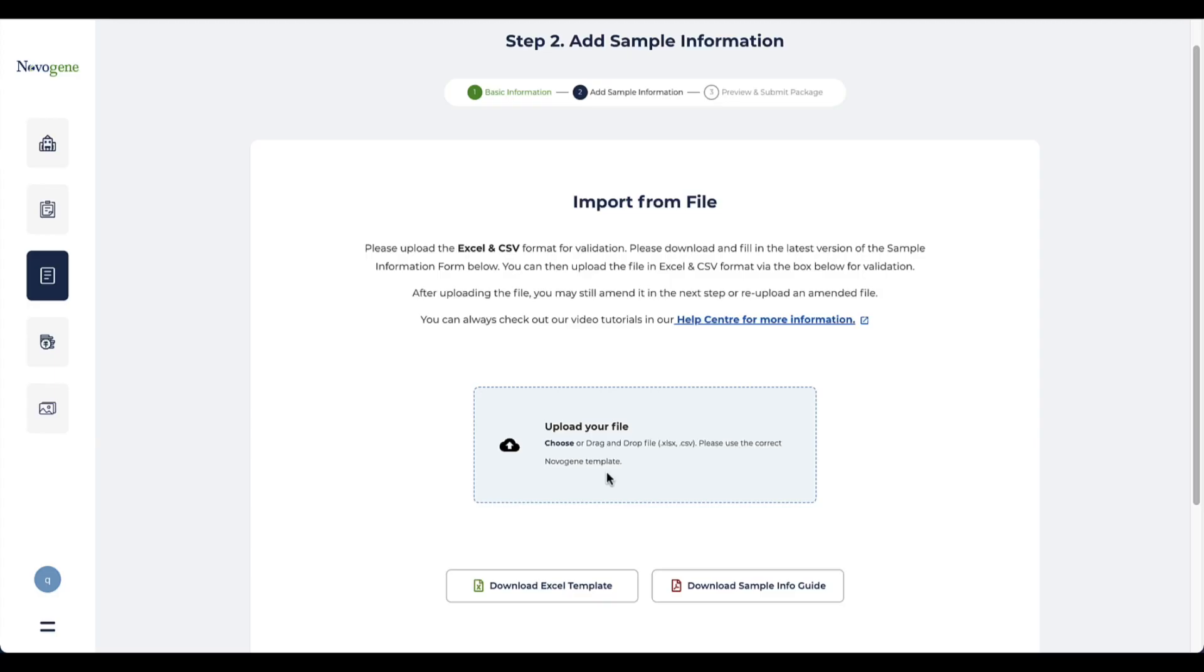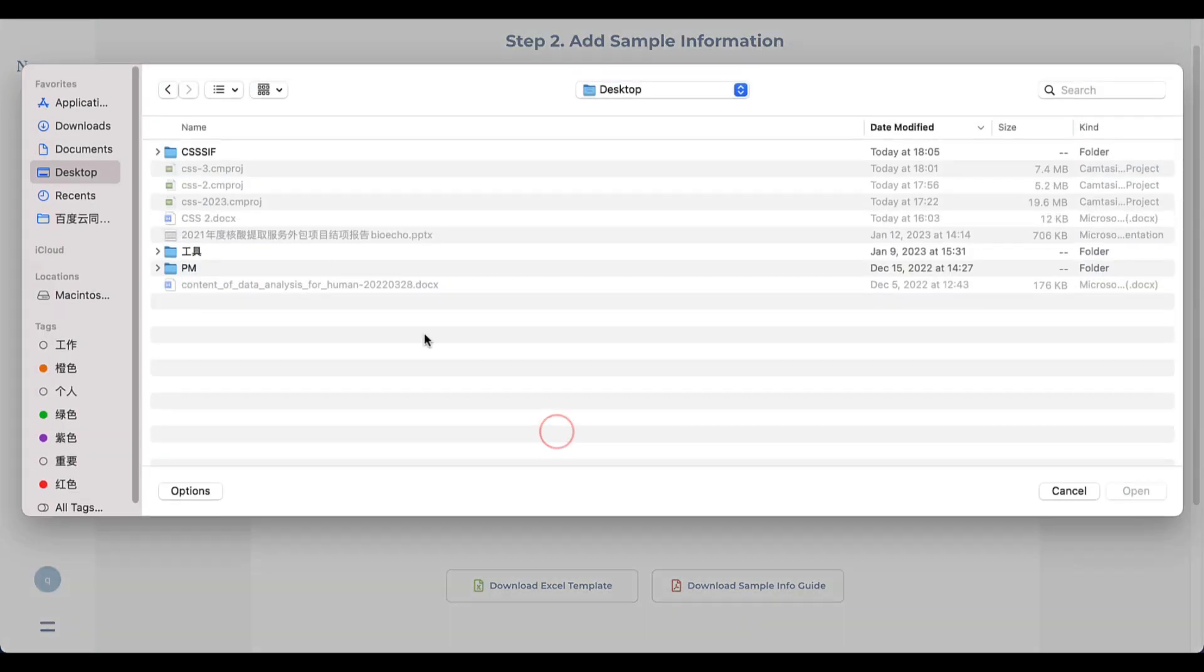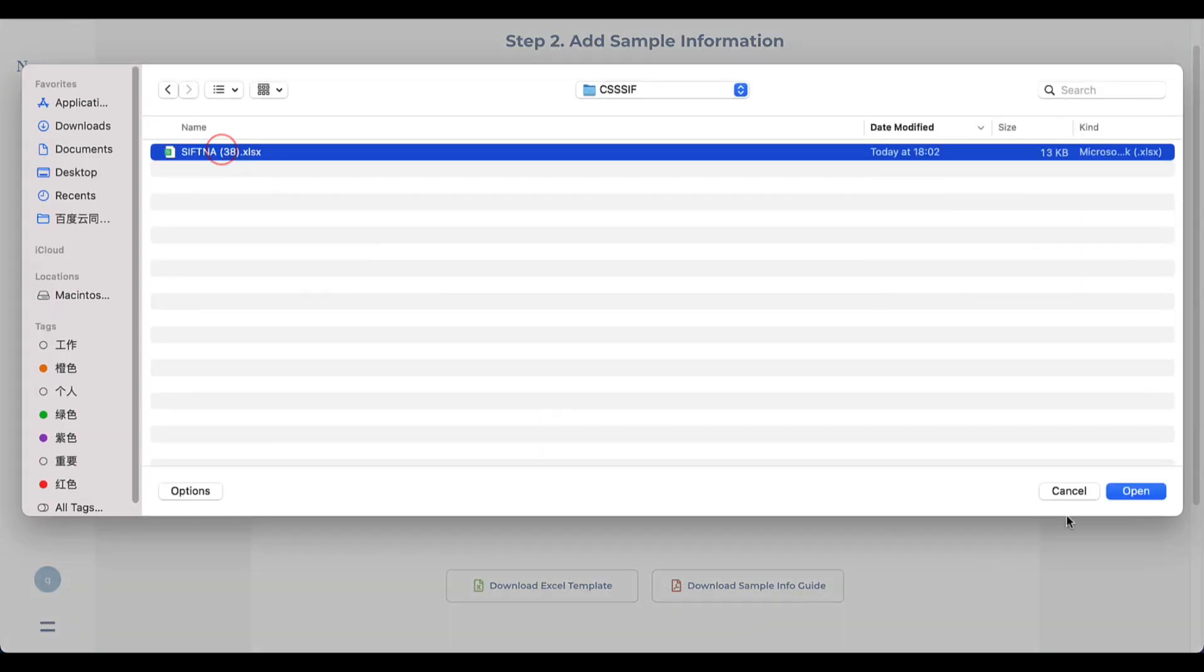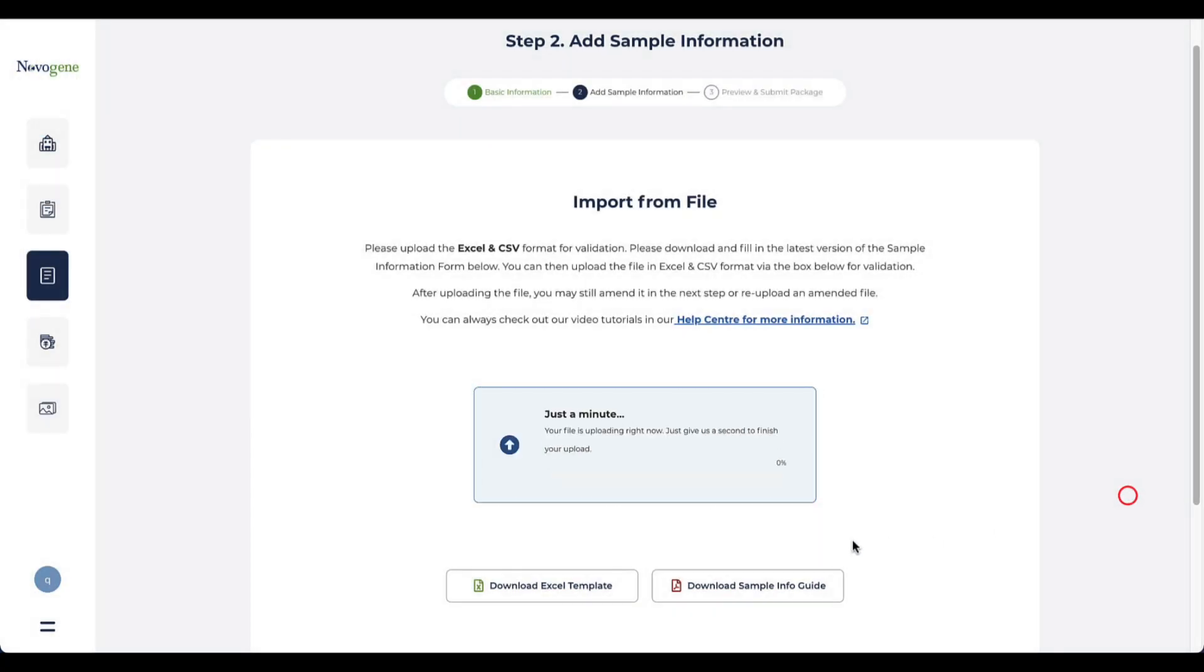After completing the essential information, you can save the Excel and upload from the button in the center of the screen. Then click continue.